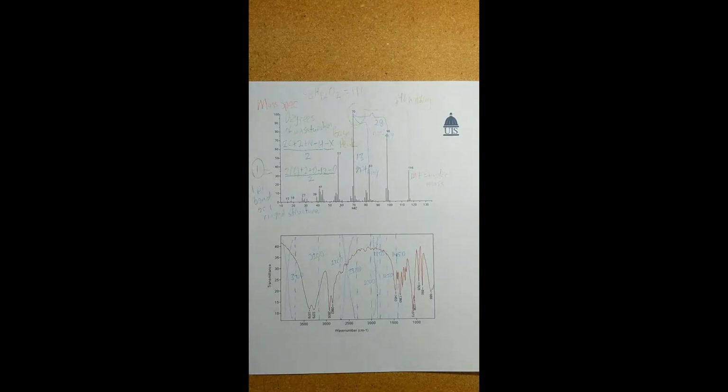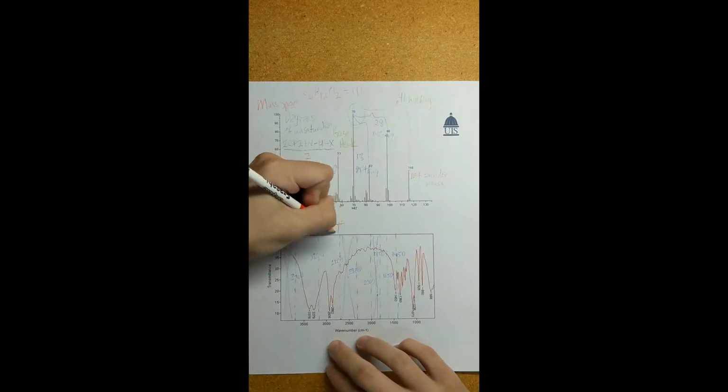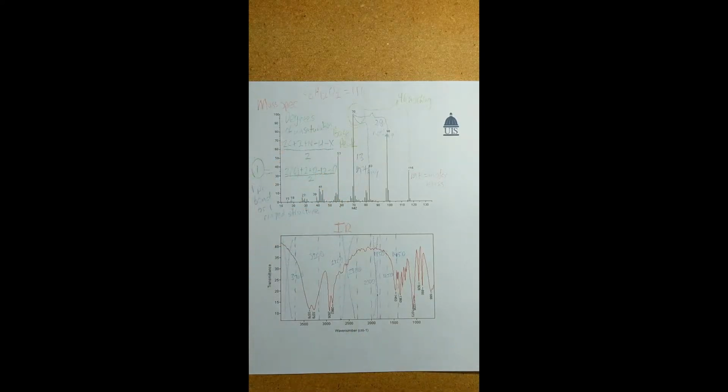Okay, so now we're going to move on to IR. Label that for us. In the meantime, I went ahead and labeled all of our zones at their respective markers, and I labeled those numbers. What I followed was found from Compound Chem as well, their IR worksheet, so that can be referenced as an outside source for this as well. So we're going to dive on in here, working from left to right. We're going to label the zones, and then we're going to take a look at what our peaks tell us and what we could possibly have in our structure.